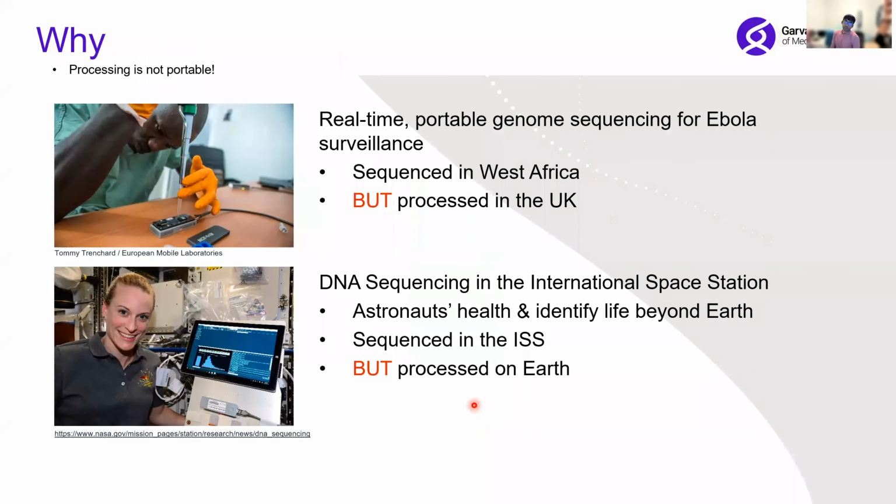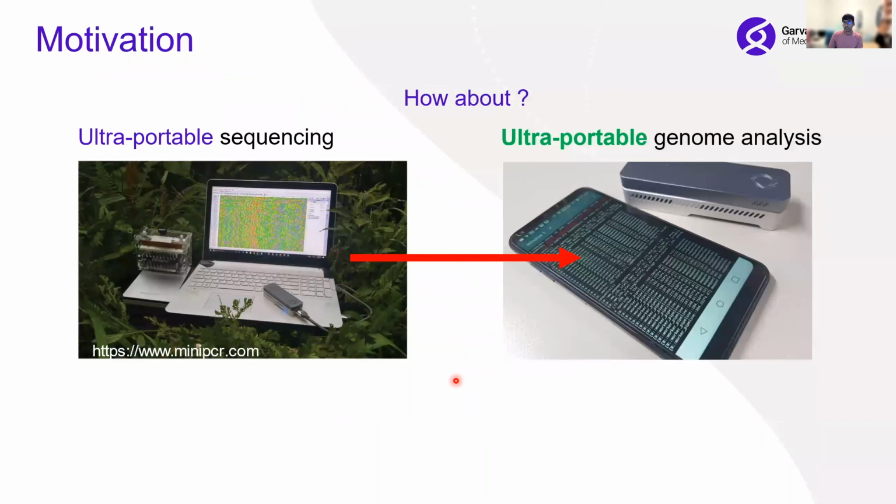So several years ago, when I started my PhD, the goal was to see whether we could make ultra portable genome analysis devices, to make real use of these ultra portable sequencing units.